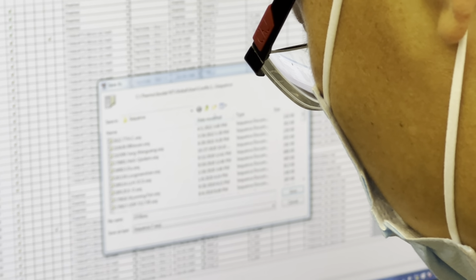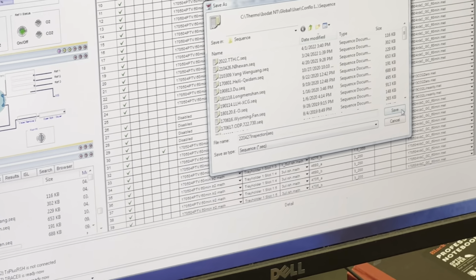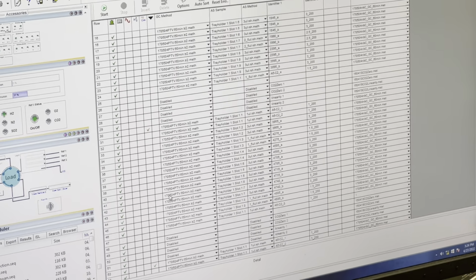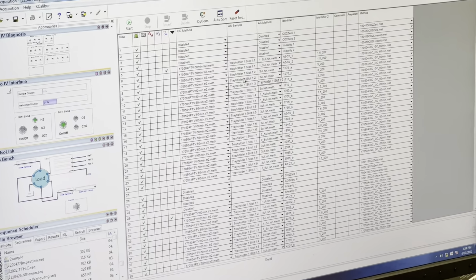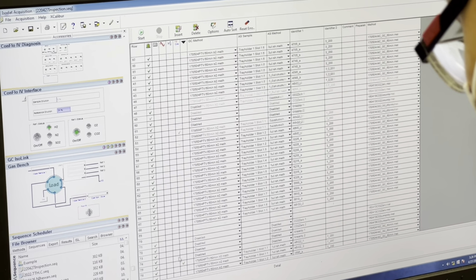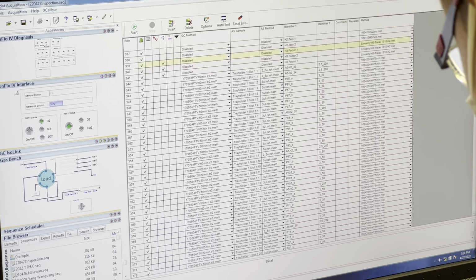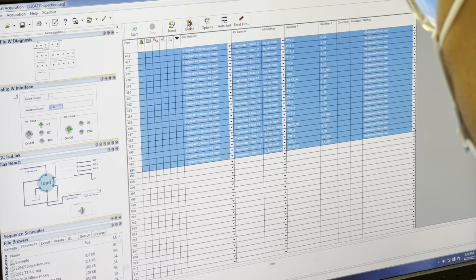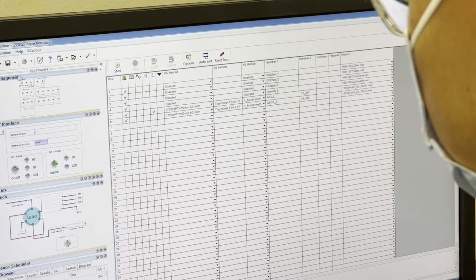0427. This is inspection. Okay, new sequence. What's this? Is this A6? I don't need it, maybe I can delete. Oh wow, that's quite a run. They're quite lazy, they just append the sample to the list. Delete. So, save.